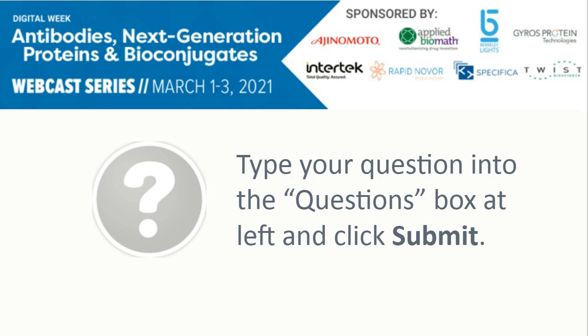Great, awesome. So the next question is, rather than purifying the PABs on protein G, should not the immunoaffinity purified on antigen column antibodies be better for LCMS? Yeah, thanks for the question. The answer is, well, we do both. We do the protein G because we want to isolate for the isotype. We want to make sure that all the antibodies we're getting are IgGs. We don't look for IgMs or IgAs. We're really just looking to down select to specifically IgGs because this is helpful for the sheer amount of data that we have to work with.